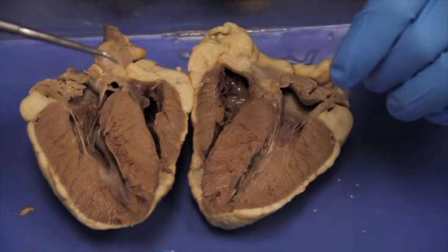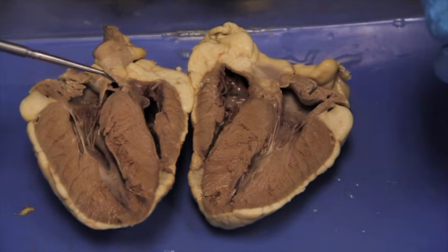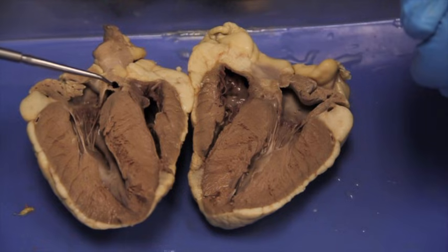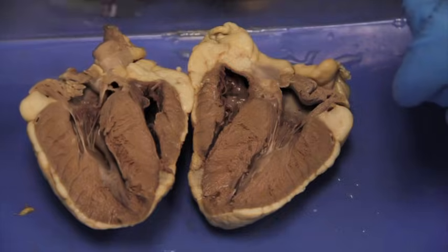Before you begin cleanup, ask your instructor to quiz each individual in your group on the parts of the heart. Once quizzed and your instructor gives you the green light, go ahead and clean up your area, tools, and throw away your heart in the correct place. Good luck.